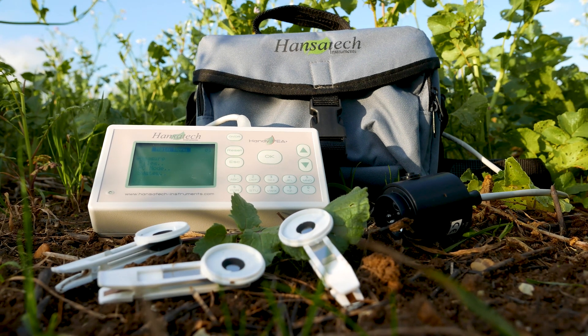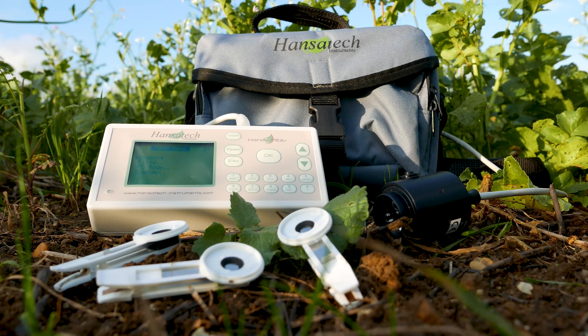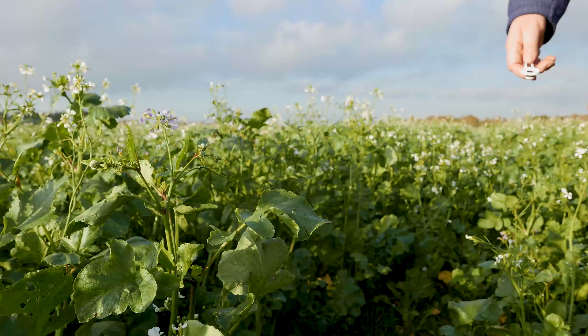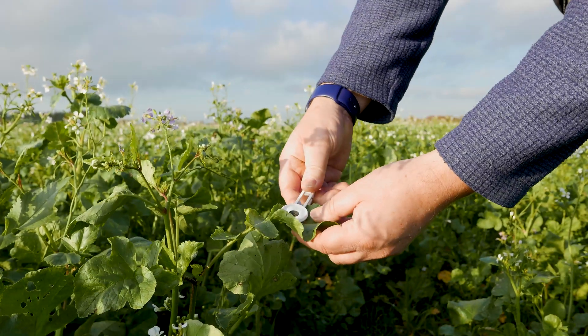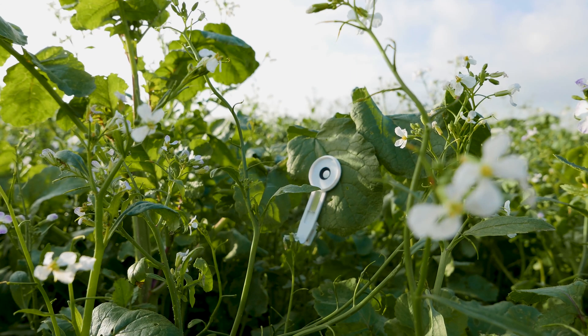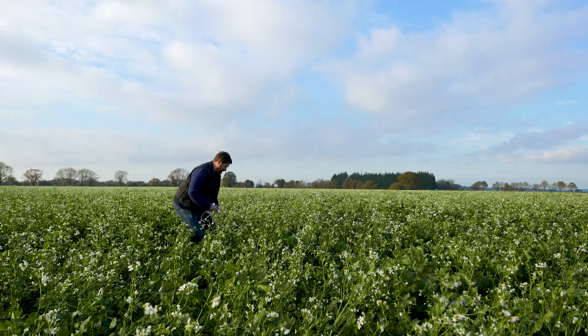This is the Handy P Plus, a highly configurable, ultra-portable research chlorophyll fluorometer from Hansatec Instruments. Handy P Plus performs measurements of fast chlorophyll fluorescence induction kinetics with a sampling frequency of up to 100 kHz.